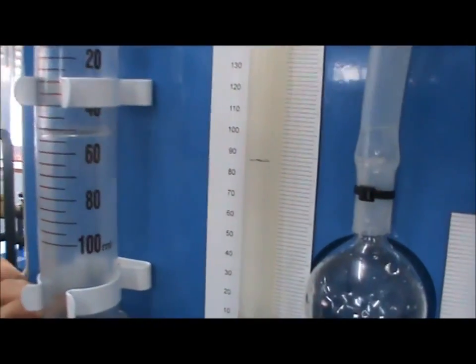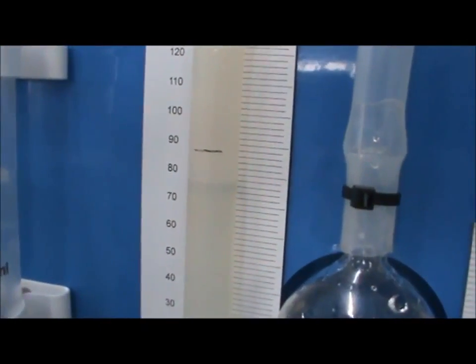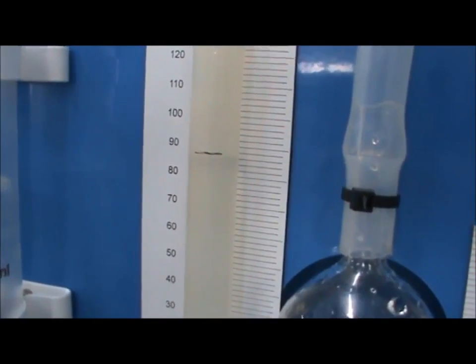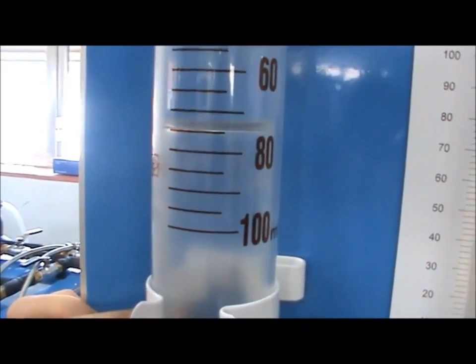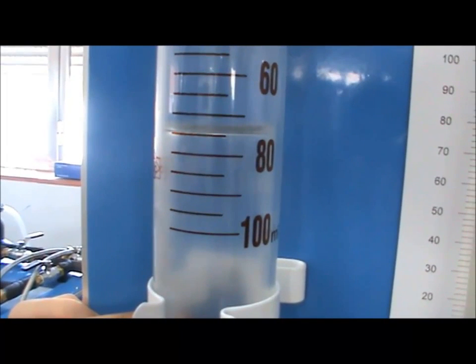Pull the plunger down to bring the solution to the marked level, and carefully measure the value shown on the syringe. In this experiment, the KOH solution absorbed 25 mL of CO2.